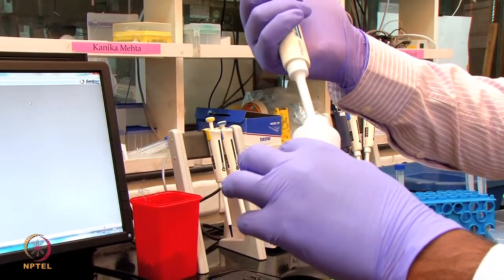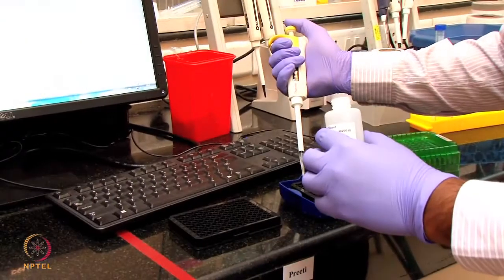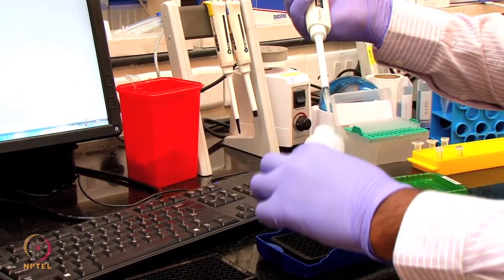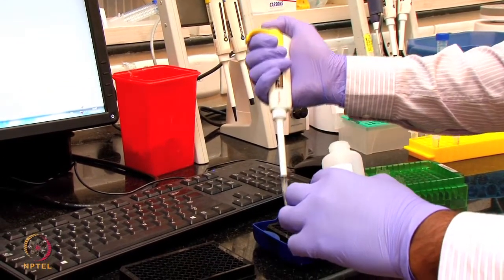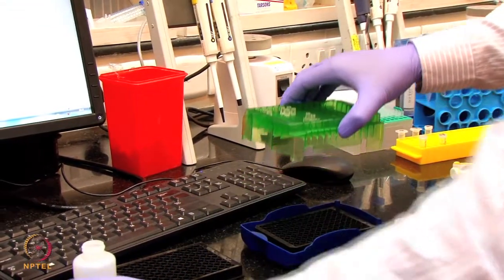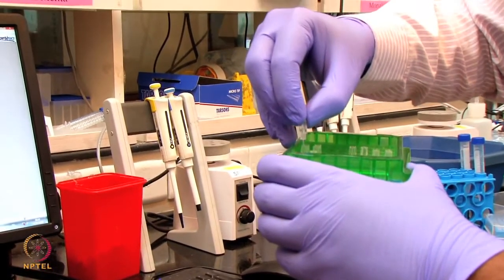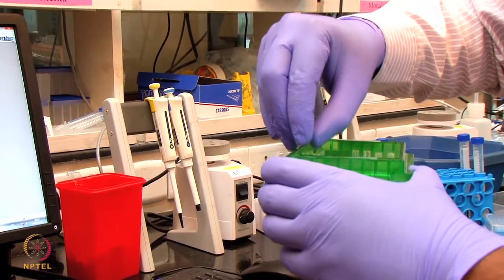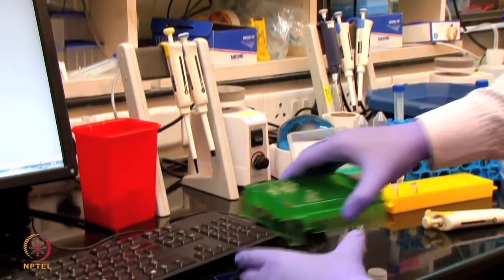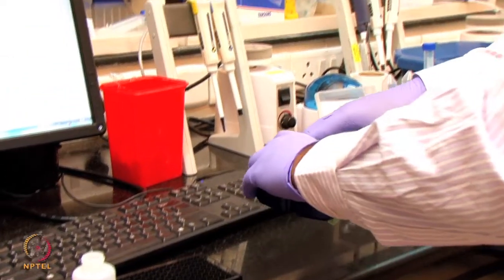Here I am going to take 200 microliter of this PBST buffer and add it in A2 and B2. Now the sensor position I'm changing from A1, B1 to A2, B2. So now I will start the equilibration of the sensor with this particular buffer.